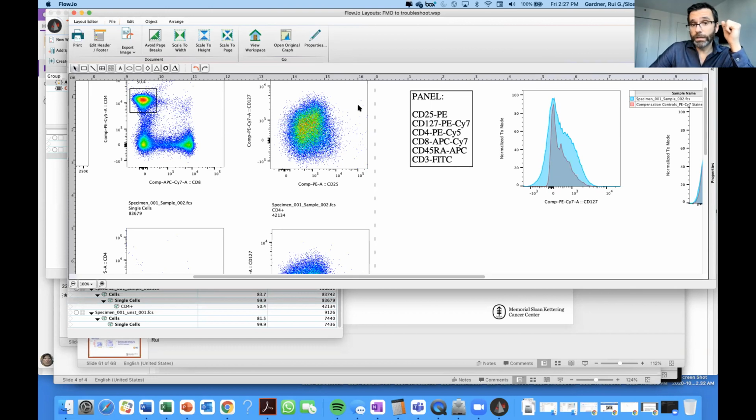Again, you can test a single versus a grouped FMO, or actually I would say test single versus FMO. I wouldn't group them particularly. I don't know if Derek or Kathy have any recommendations here, but I would say I would prefer not to group them and just run them individually. It doesn't take much time, and you can even do this, if you have these capabilities in your instrument, with a plate reader. But anyway. Yes, I probably wouldn't group them either.